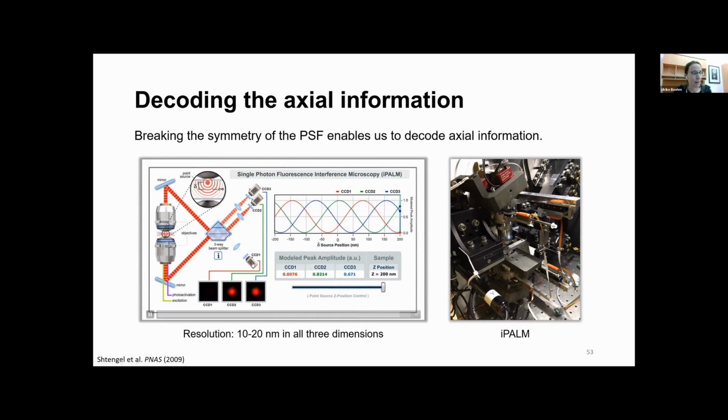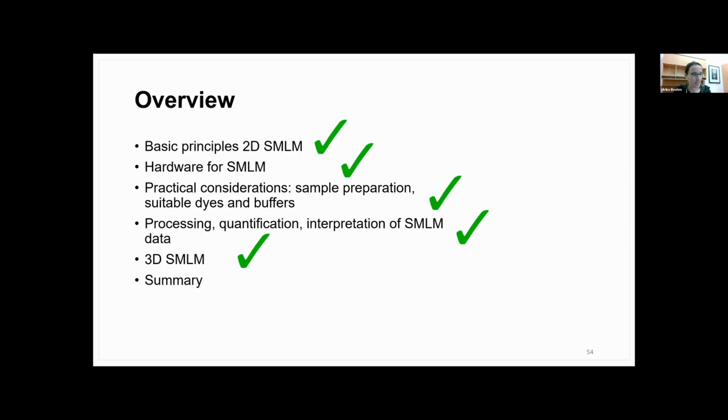Due to slightly different optical paths, the signal which you detect in the end will, as you can see in the scheme, vary depending on where the fluorophore is in space. You can nicely trace that back, with very high precision, to where along the optical axis the signal came from. So that's quite a powerful method because of the interference.